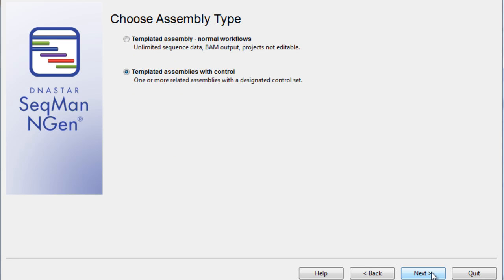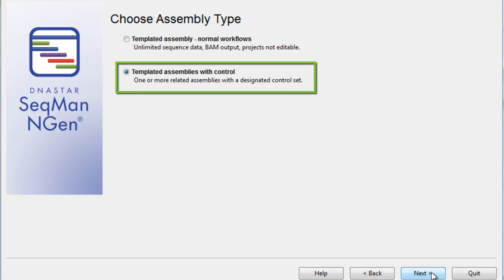Now, for this particular workflow, we are using a control, which we'll talk about more later in the wizard. So, we'll select the Template Assemblies with Control option.